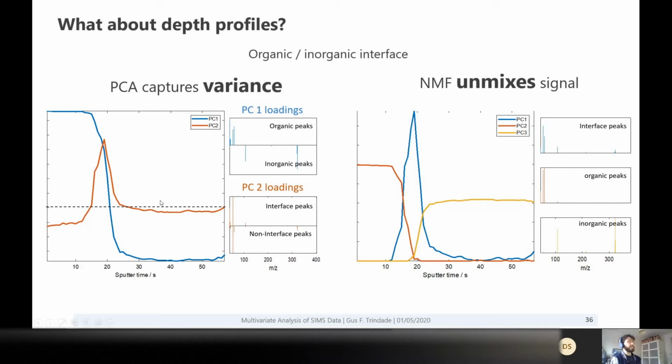It's quite common to use PCA first before you do NMF, because NMF is easier to explain, visualize and interpret, but you have the downside of having to input how many components there are. So if we use PCA first, it may help us figure out how many to use for NMF. Does that make sense? Yeah, this makes sense. Thanks.